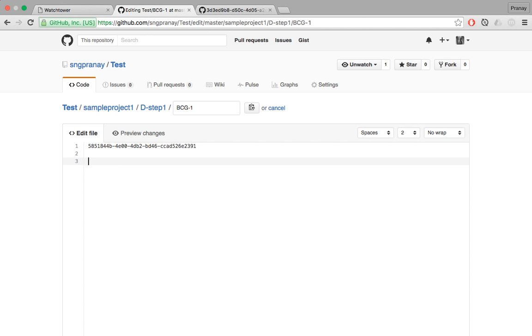So let's just do observation 1, which is this sample contains XX percentage of YY. I don't know, whatever biologists like observing. So similarly, I can have a bunch of other observations.